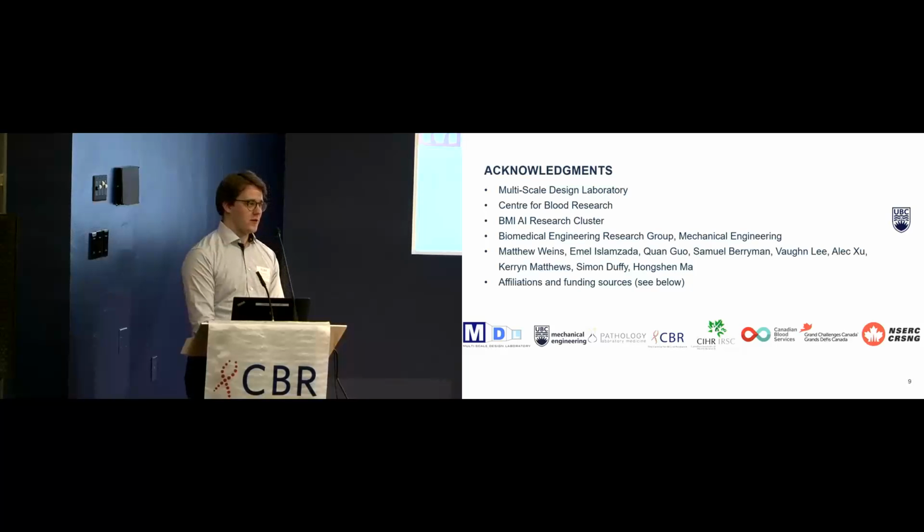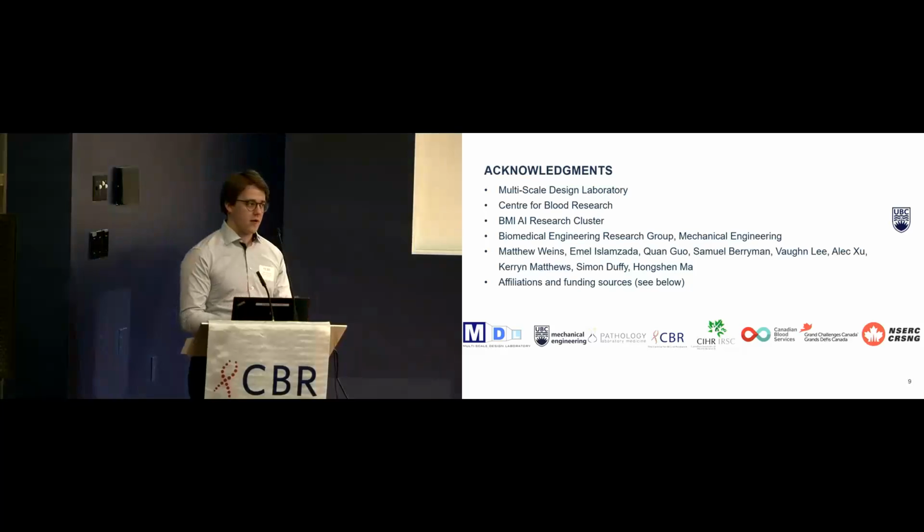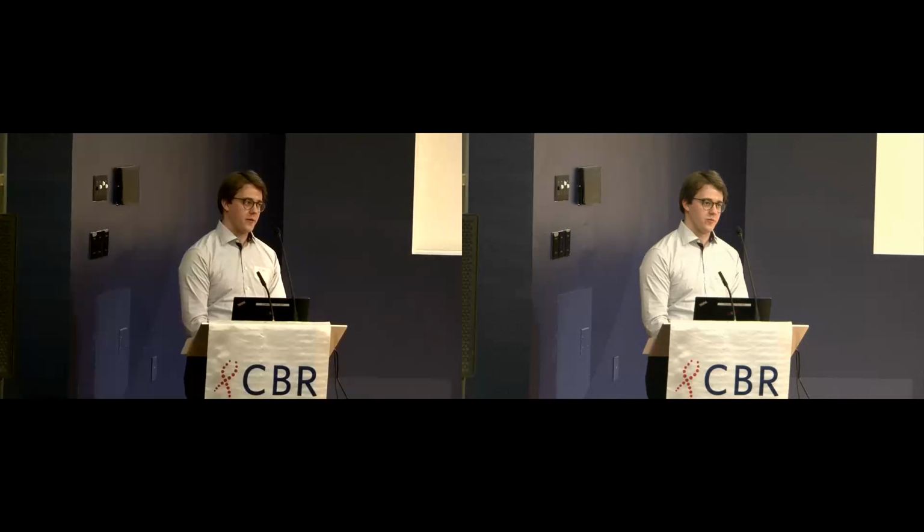One thing that we want to do that'll help the accessibility of this approach is to see if we can get the model to learn deformability based on blood smears. So it's just a standard laboratory practice. And if we can do that and integrate the use of this model into existing procedures, that would also help its implementation across the board.